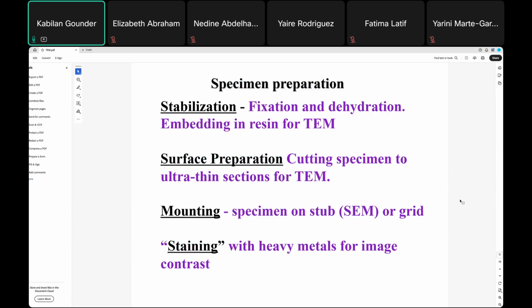So after you dehydrate the sample, what is important for transmission electron microscopy is to hold your sample. We discussed that in light microscopy, paraffin is used to hold your samples, and it also helps to take sections of your tissue samples. Also, if you fix samples with liquid nitrogen, the OCT medium is your supporting material for cryosectioning.